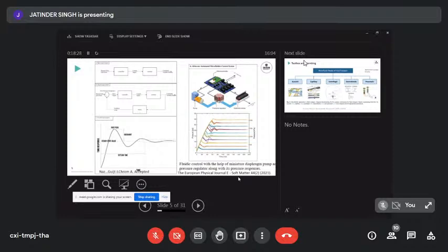So a syringe pump is very easy to program, but be mindful that while you think you set a flow rate, if you've got a lot of back pressure, your chip is blocked, your stepper motor is not really intelligent, so it just keeps on moving and building up the pressure and changing your flow. So it's not always the most ideal pumping platform.